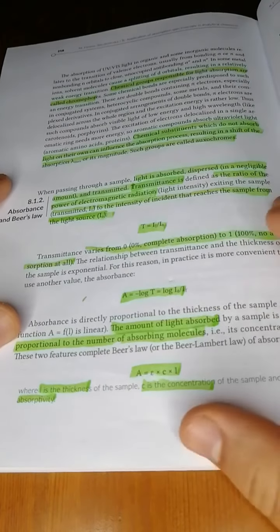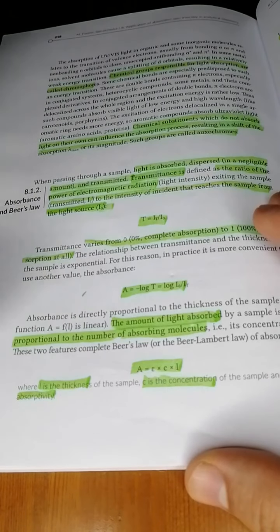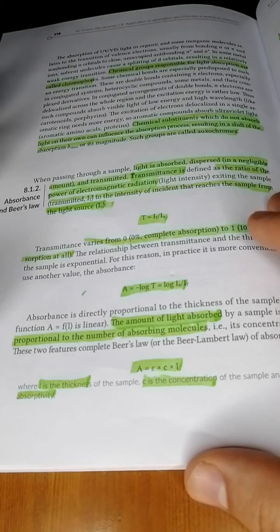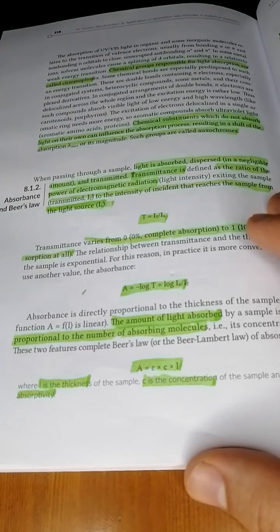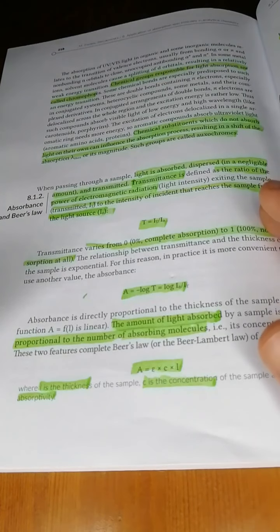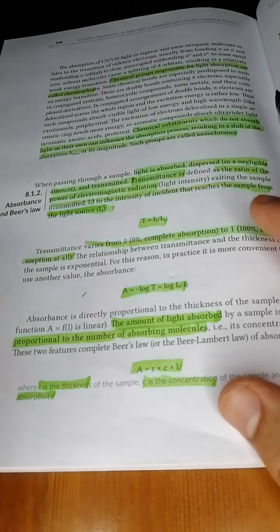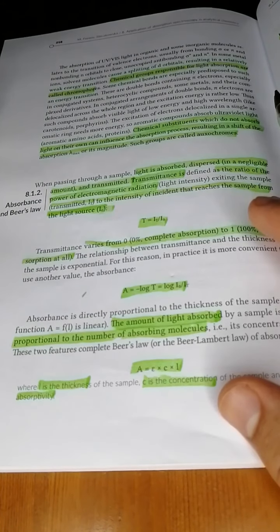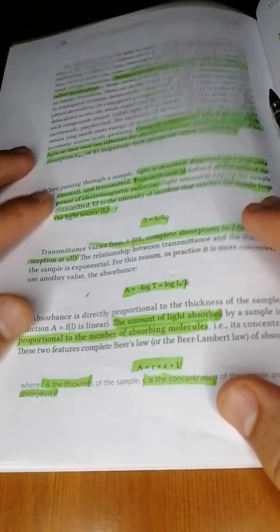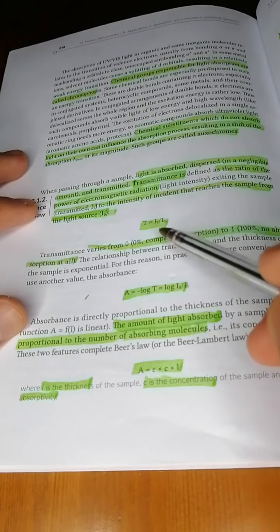Okay, so like we said, when passing through a sample, light is absorbed, okay, dispersed and transmitted, and you also get reflection, and you get loads of interactions whenever light comes in contact with pretty much anything, okay? So transmittance is basically telling you how much of the light that you gave the sample has exited the sample and how much has been absorbed by the sample at a certain wavelength. Okay, and now how we calculate that is, this is transmittance, by the way.